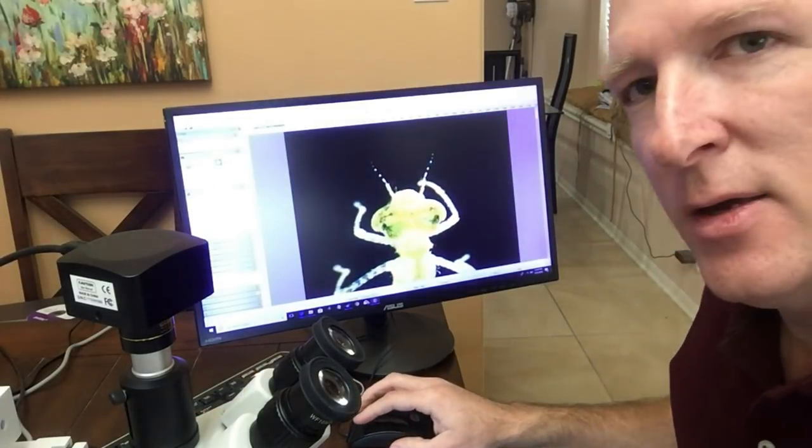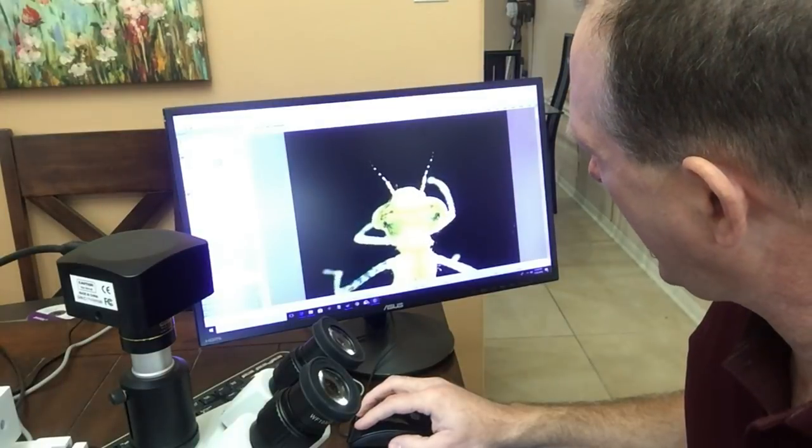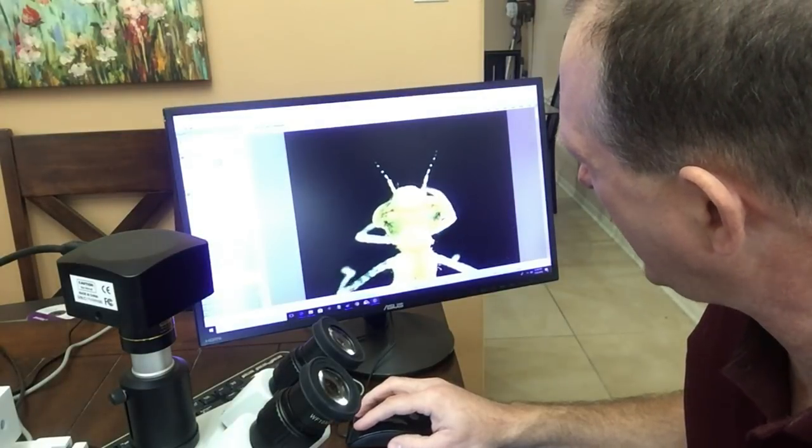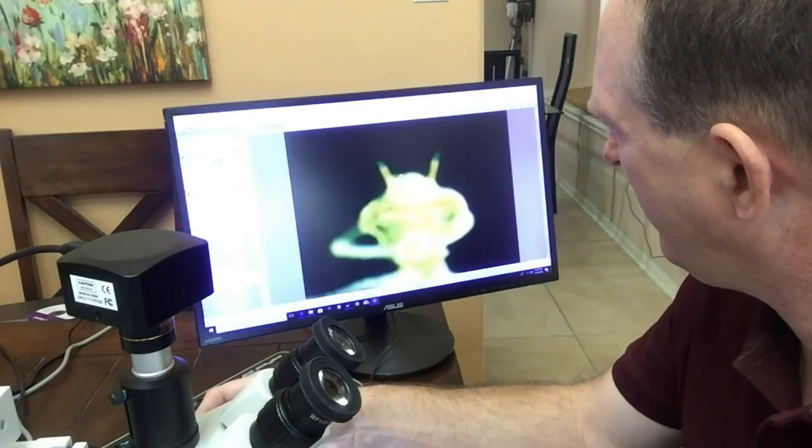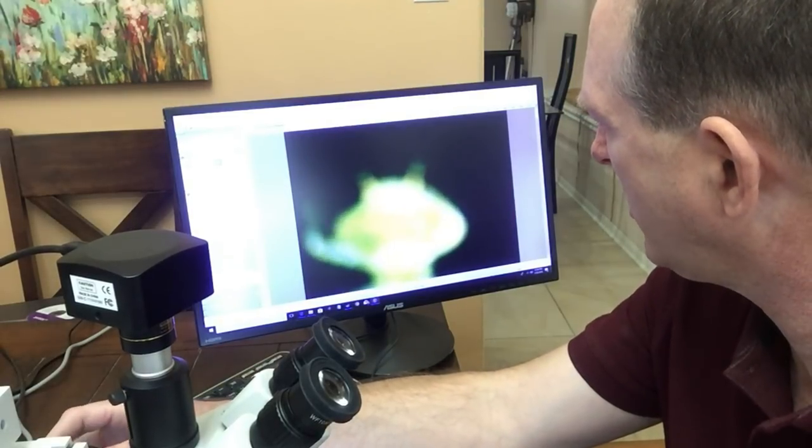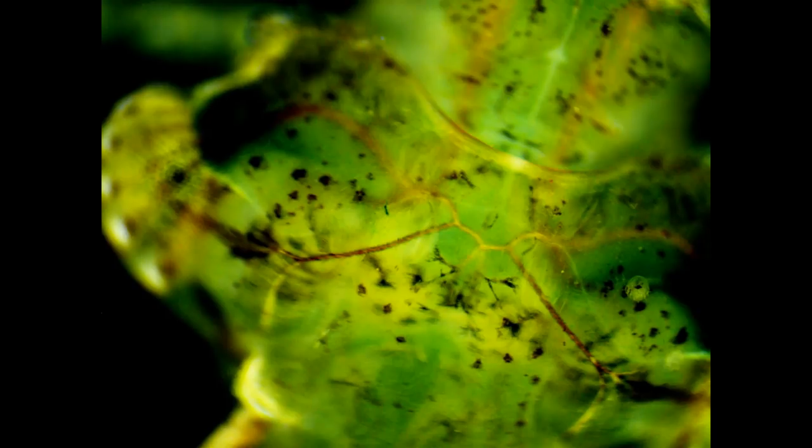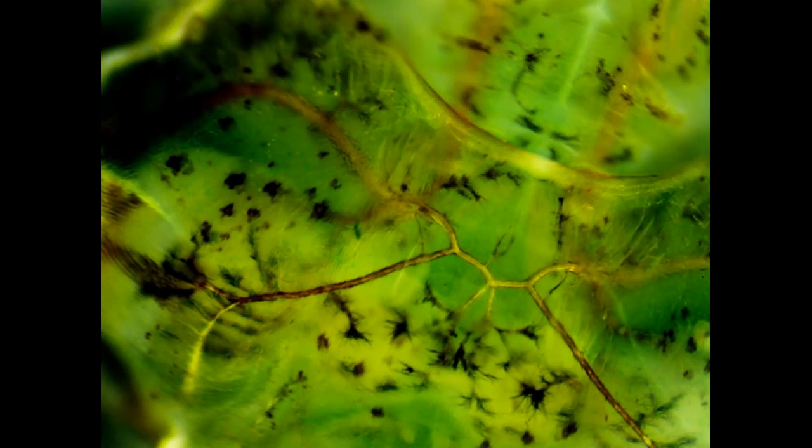Alright, you can see there. Look at that. So you can see the black eyes there, little dots, and then you can even see the veins that are running through this animal. See here, you can see the veins. Look at that. That's a nice good-sized blood vessel, and these look like they're leading to the eyes right there.